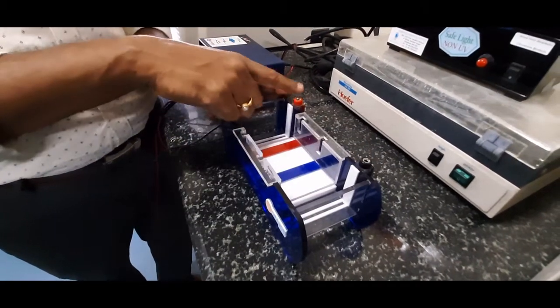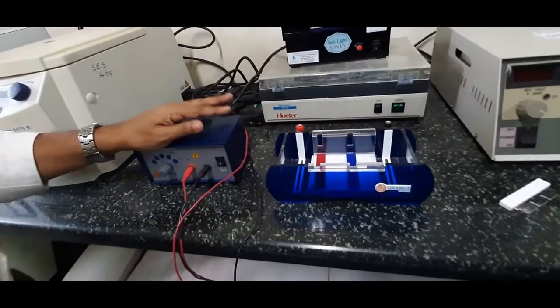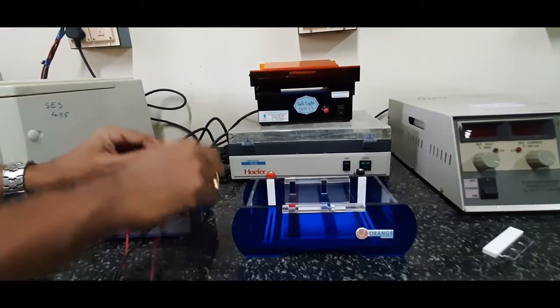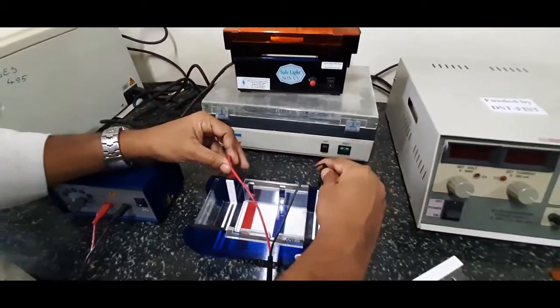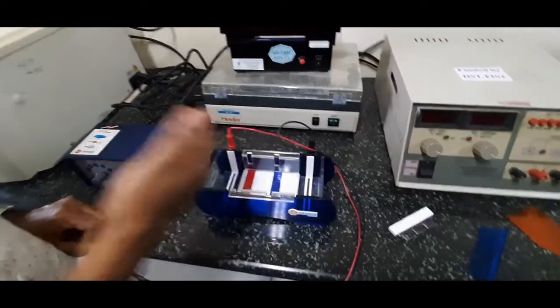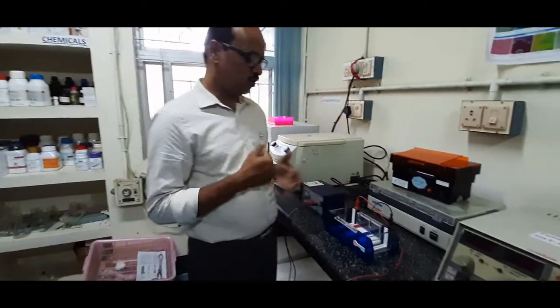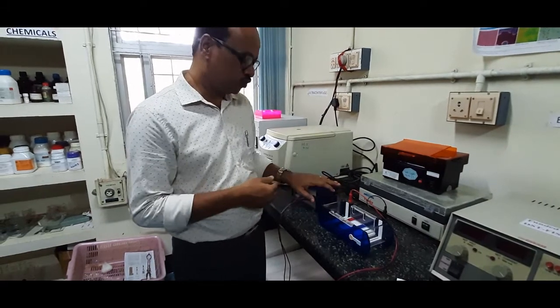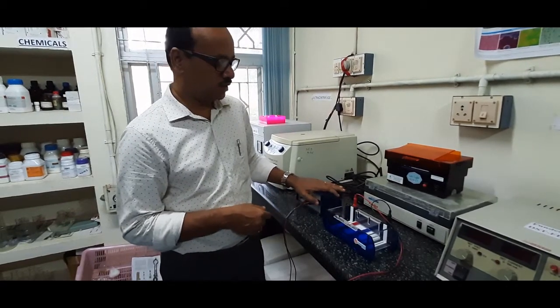You can see two terminals — a positive and a negative terminal — which are connected to a power pack. In the power pack, you can adjust the voltage, and it has positive and negative terminals that must be connected with the correct polarity. DNA nucleic acids are negatively charged, so they move towards the positively charged pole. After loading the nucleic acids and switching on the power pack, the current traverses through the buffer and the nucleic acids migrate towards the positive pole, separating the biological material.